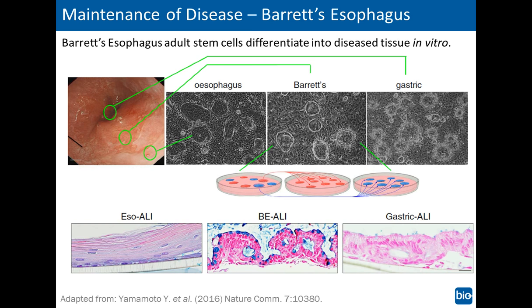And they performed gene expression analysis and saw that they had upregulation of genes that were in fact intestinal genes. And this was quite interesting. And they then compared the Barrett's esophagus gene expression profile to more advanced esophageal cancer, and they saw some of the same changes. So on a principal component analysis, they would cluster the same, except for the changes in oncogenes and P53, which were absent in the Barrett's esophagus.